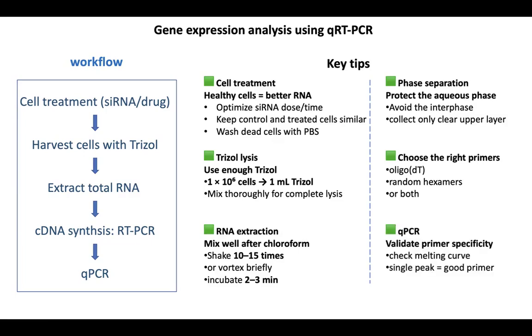Finally, for qPCR, it's important to confirm primer specificity using the melting curve. A single sharp peak indicates clean amplification and reliable qPCR data.